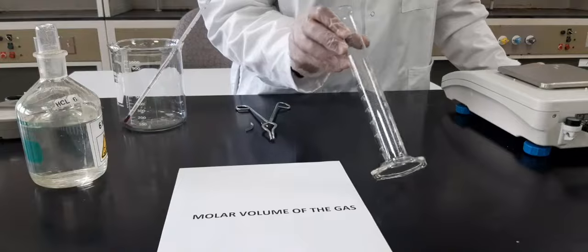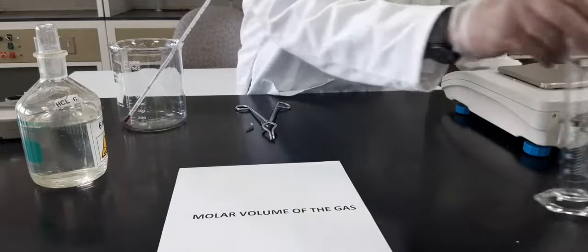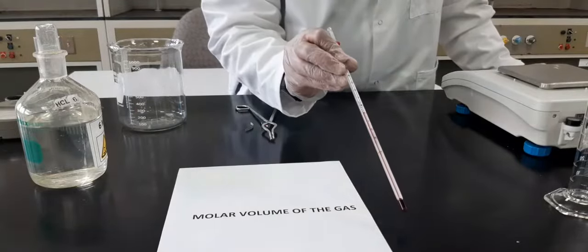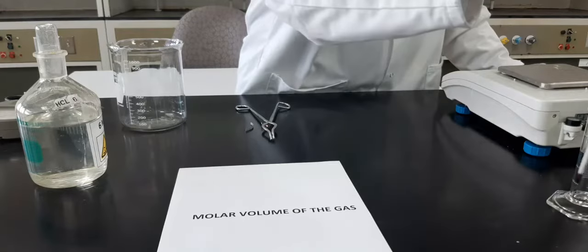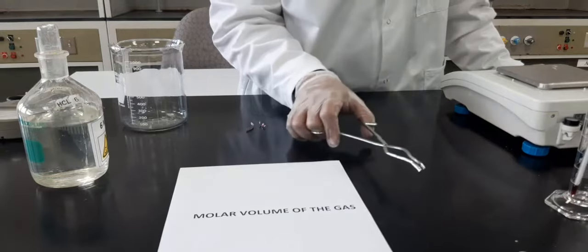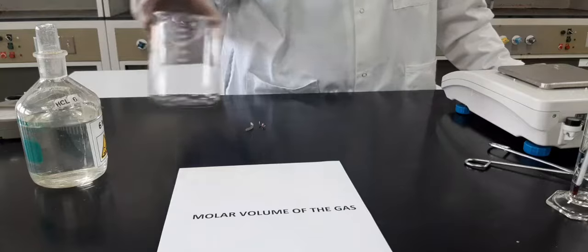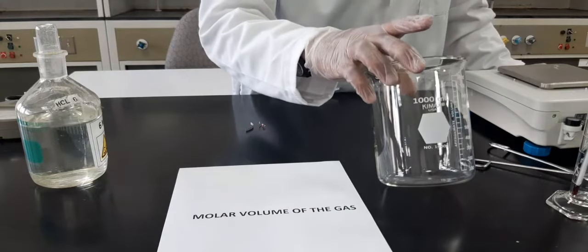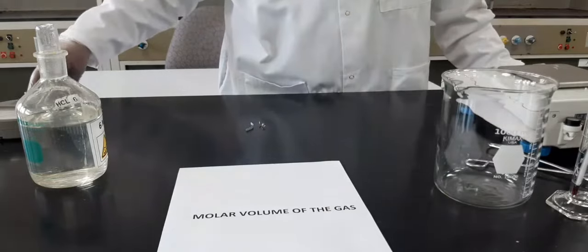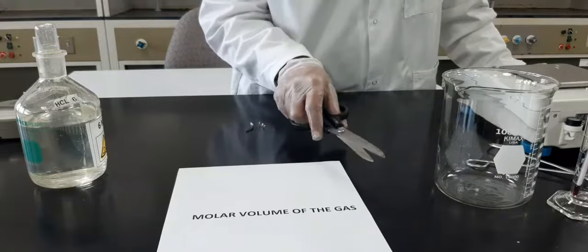In this experiment we are going to use a measuring cylinder, which is of 100 ml, a thermometer to detect the temperature, this one is crucible tongs right here, a 1000 ml beaker which will be on your table, and a scissor to cut the piece of magnesium according to our requirement.